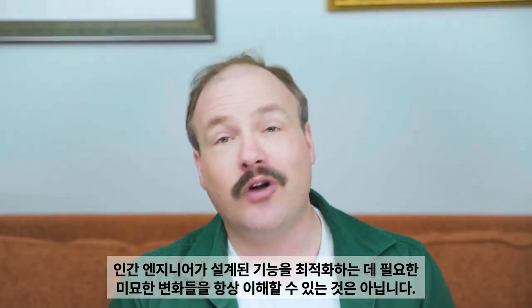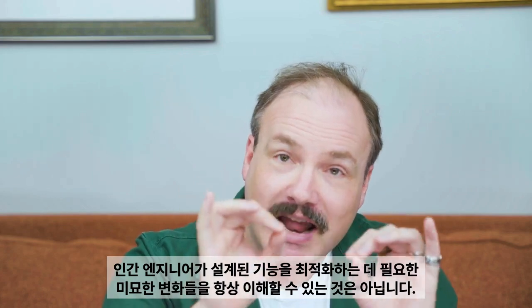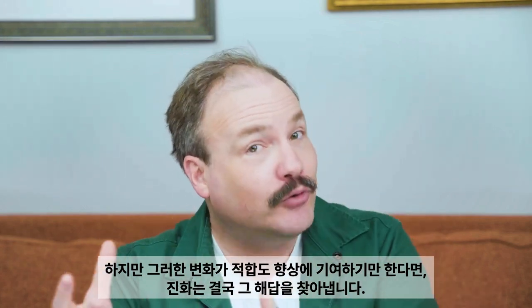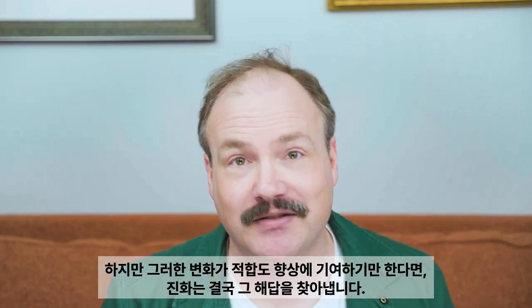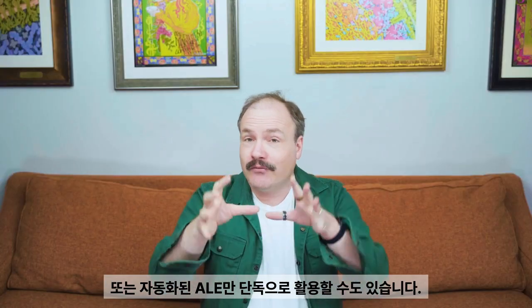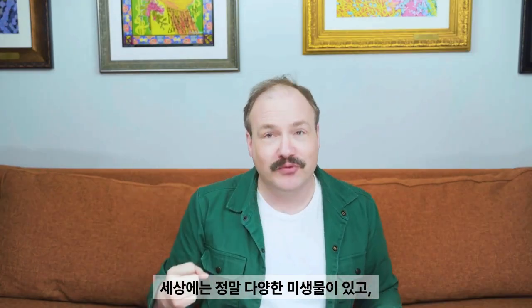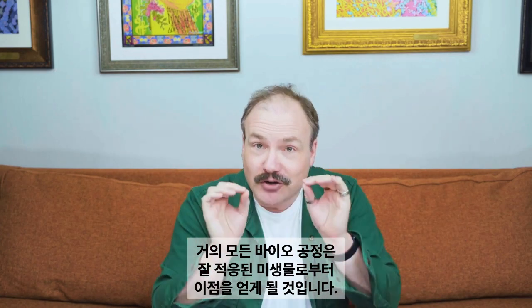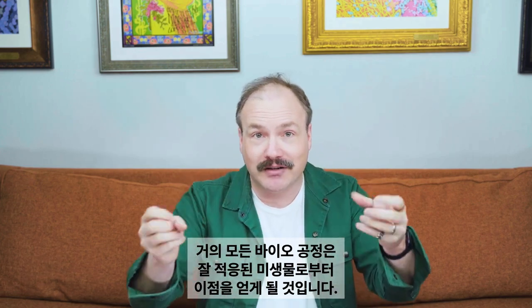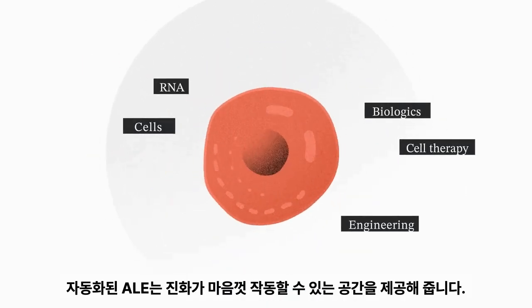Human engineers don't always understand the subtle changes needed to optimize an engineered capability, but evolution will find them so long as they contribute to improved fitness. Or we might use automated ALE just on its own, with no genetic engineering required. There's so many microbes out there, so many feedstocks, so many stress conditions. Almost every bioprocess is going to benefit from a well-adapted microbe. Automated ALE gives evolution the space to really cook.